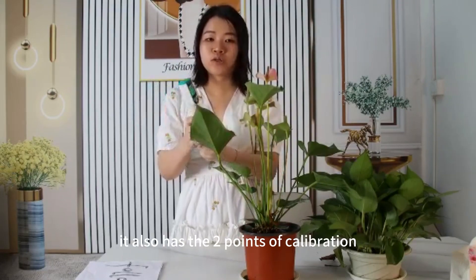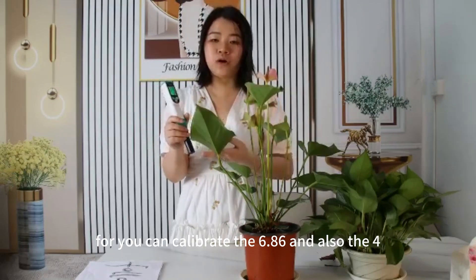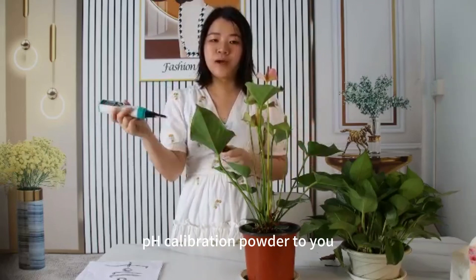It also has two-point calibration. It can calibrate at 6.86 and also at 4. And we have prepared two packs of pH calibration powder for you.